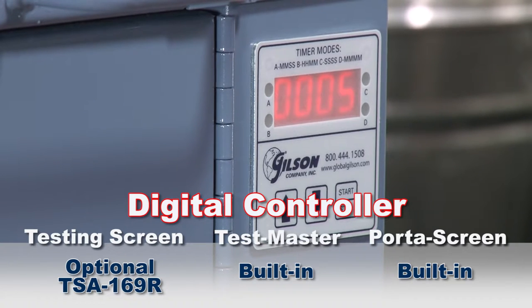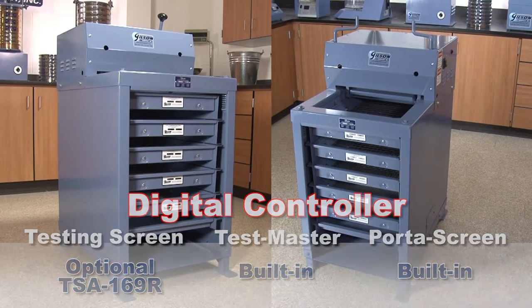Both the Testmasters and Porta screens have a built-in digital controller with a large LED display, whereas the testing screens require external timing.